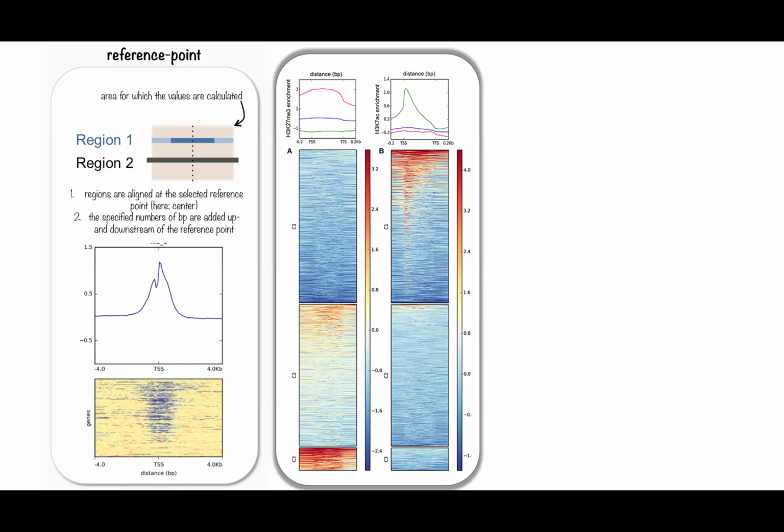And then they had a third cluster, which has a really high level of the methylation. So in doing this, you can find different categories of genes that might be of interest to you. And you can also do it for the same mark across conditions and things like that. Any questions on that part?